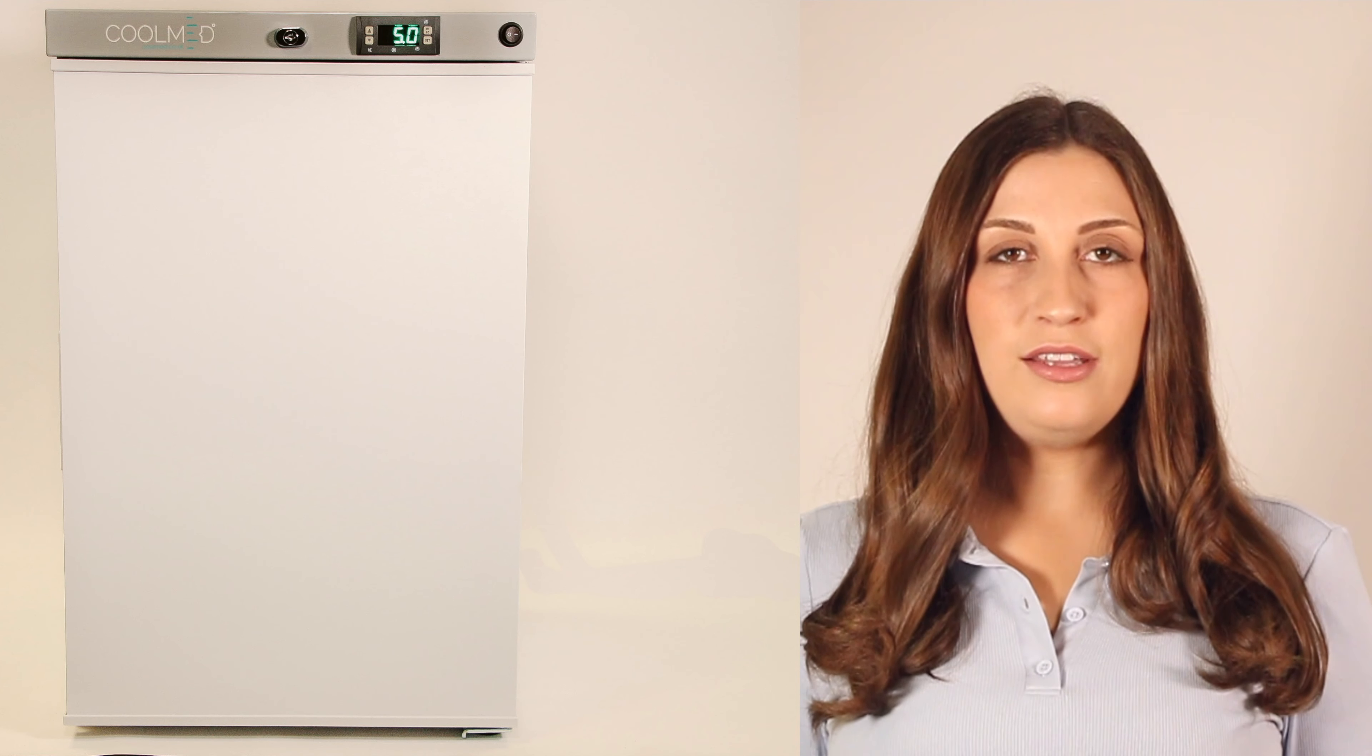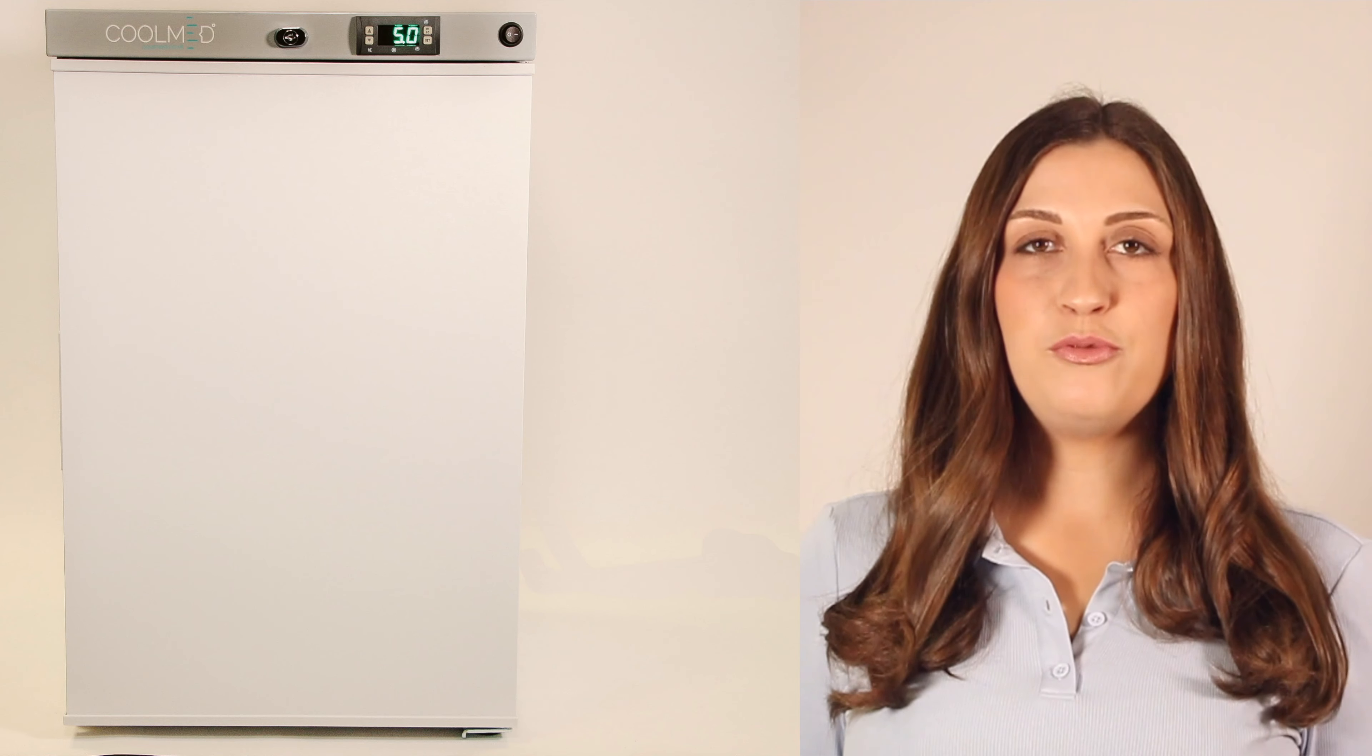Our CMS59 is a 59-litre capacity medical fridge, the largest tabletop size fridge in our range. This fridge is ideal for storing small amounts of products.